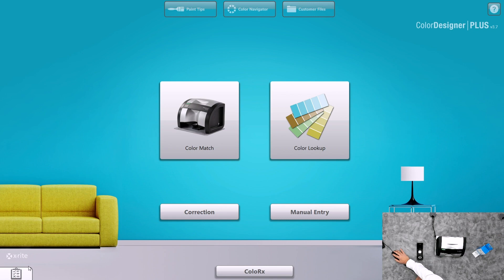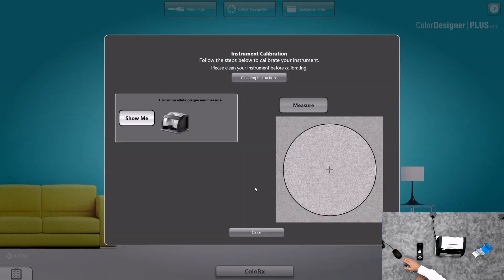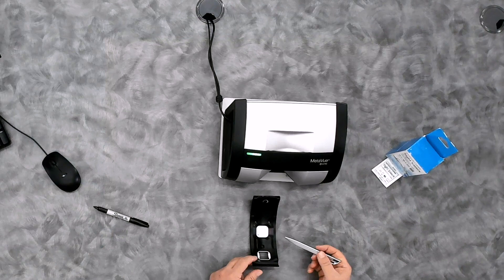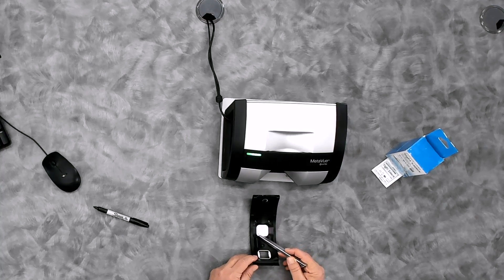I want to walk through a couple of examples of what can happen during calibration that can throw the instrument off or not allow you to calibrate properly. Here I have the rail that I detached, and I want to indicate a couple of things that are important. The calibration plaque has a hole for the camera to make sure that you're in position for color measurement. If that hole gets covered up or fills up with dust or anything like that, the measure button will not illuminate, thus not allowing you to measure.